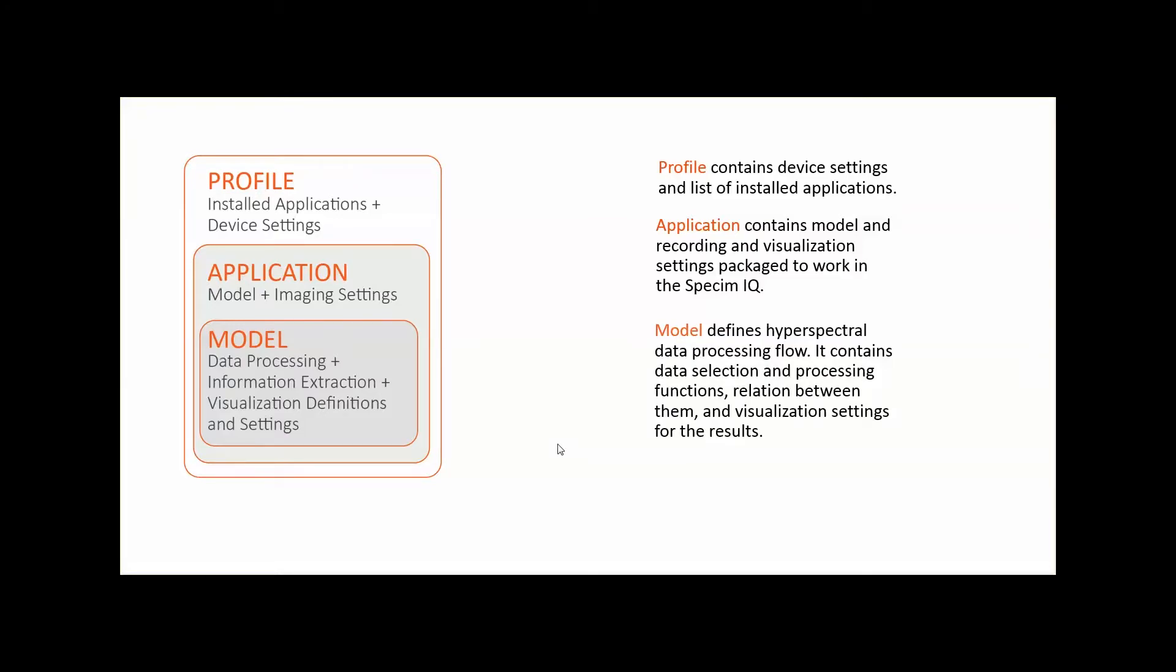This means that to create an application we will need a model. A model contains information about data processing, information extraction, visualization definitions and settings.